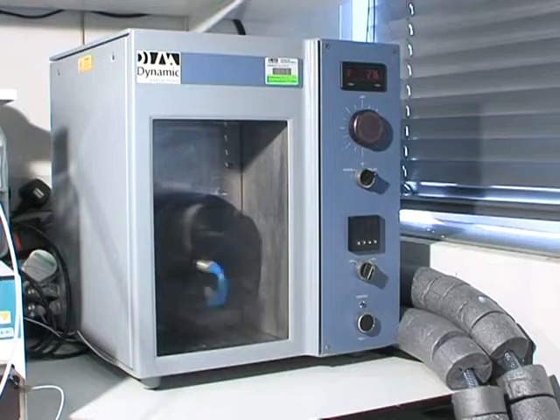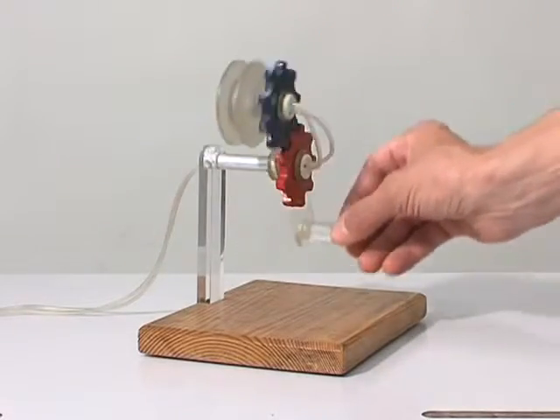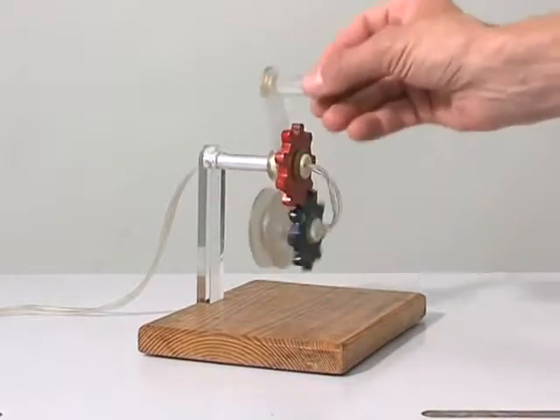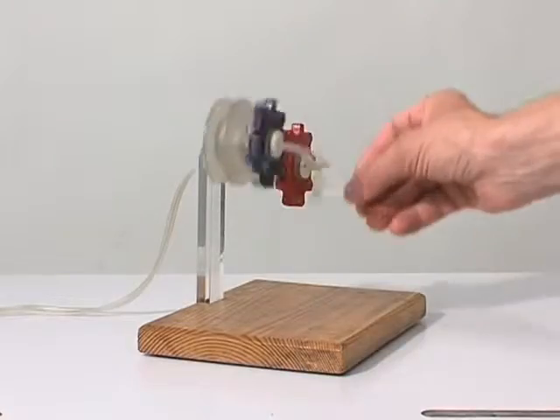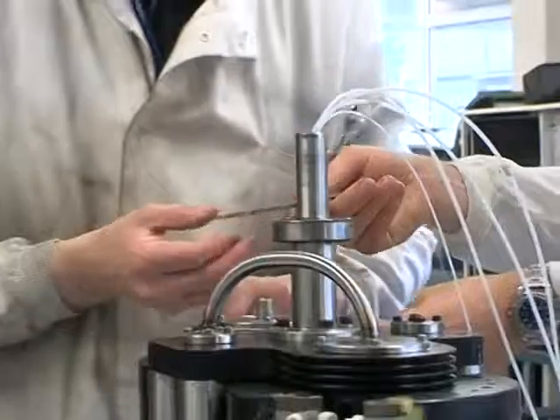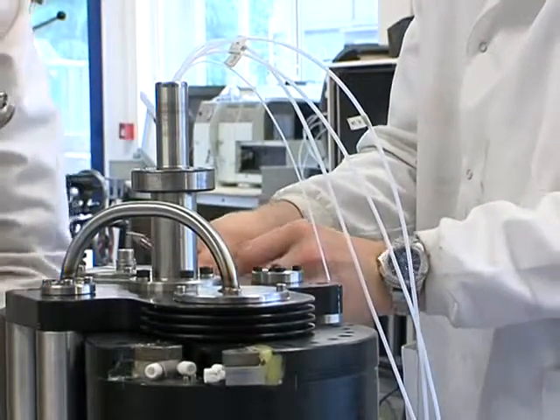The synchronous planetary motion of the countercurrent chromatography bobbin has a special feature significant in the design of instruments. There is no twisting of the flow tubes linking the coil to the pump and detector. This is because the rotation of the bobbin about its own axis unwinds the twist produced by its motion around the Sun gear. This gives the instruments no rotating seals to cause trouble.